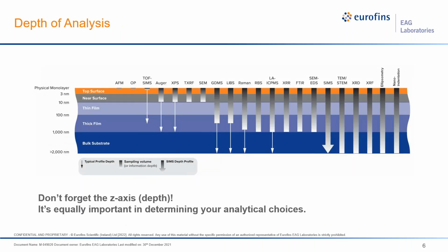Analysis distance into the sample has a major influence on selecting the best technique for a given material and objective. The analysis depth of laser ablation is strongly influenced by the wavelength of the laser, operating parameters set by the analyst based on experimentation and experience, the opacity of the target material, and whether the target is a cohesive solid or a pressed powder. While top-down depth profiling with laser ablation is possible, more typically depth profiles are measured in cross-section, such that depth becomes an X or Y axis relative to the laser.